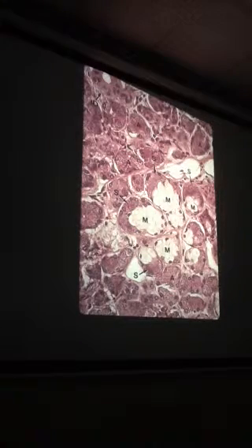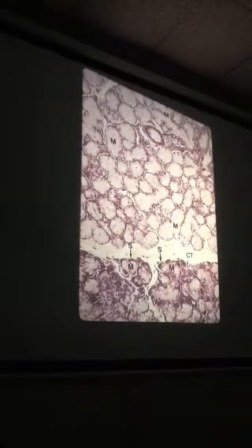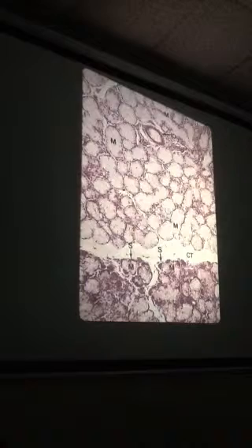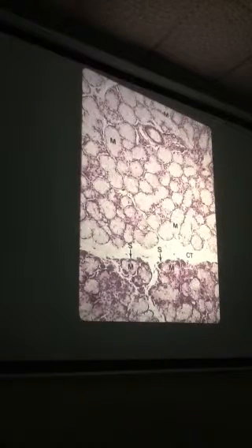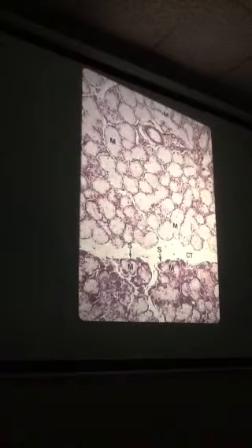All right. And then you take a look at the next one. Oh, that looks like all light cells. Mucus. So we now say, oh, it's almost all mucus. Gotta be sublingual. Great masses of mucus cells, though you still have little dark areas, little serous clusters. So we say mostly mucus, but you can still have serous, little demi-lunes.